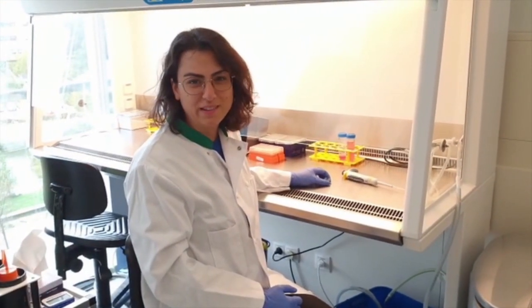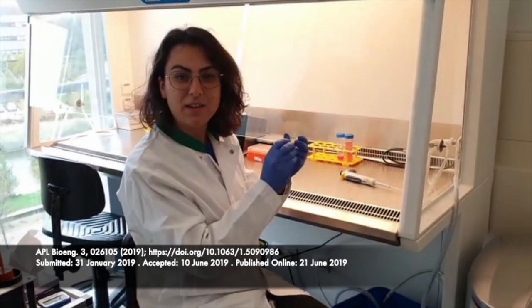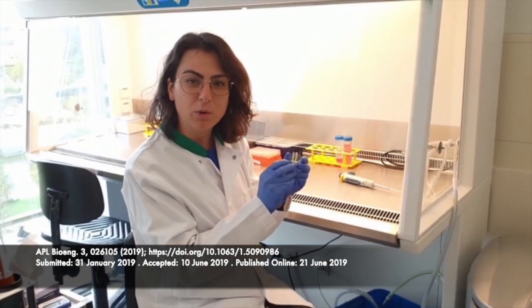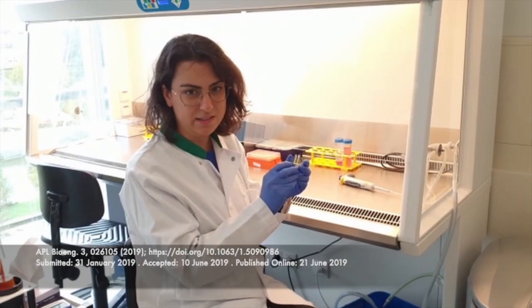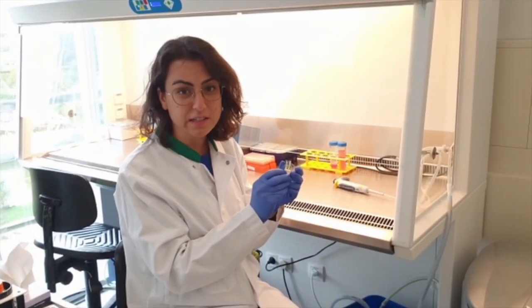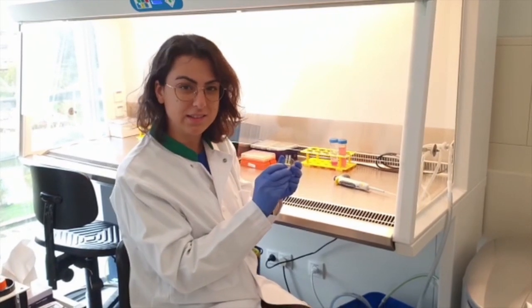Hello, I'm Merve. I'm working as a PhD student at Leiden University Medical Center. Here is the vessel and chip platform we use in our lab. I'm working on modeling human blood vessel diseases on the student. We can generate patient-specific engineered vessels and study the disease mechanisms.